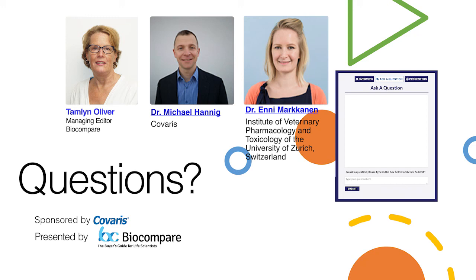I think good conditions in that case, because FFPE usually is stored at room temperature. That's why it's also so widely used, because it's so easy to store. So I think in that case it's very important that you don't go between 40 degrees and 5 degrees. You don't have huge temperature changes all the time. And the other thing is low humidity, that the blocks don't get exposed to humid environments.